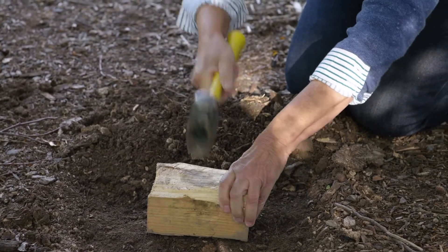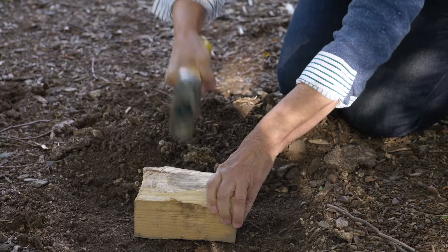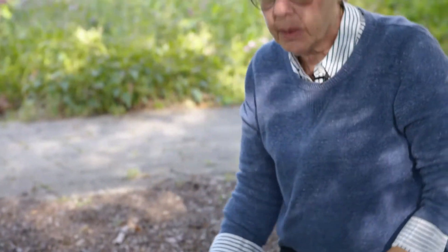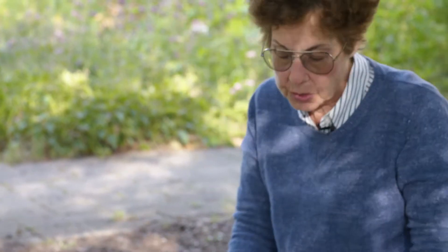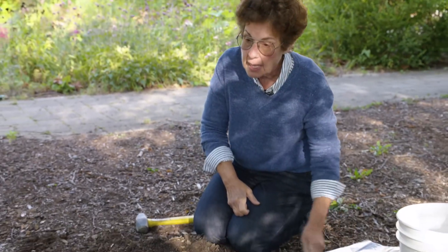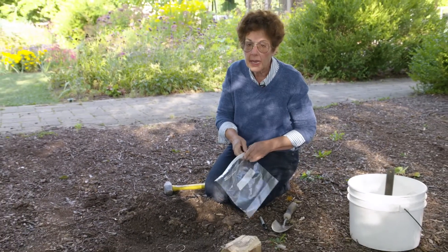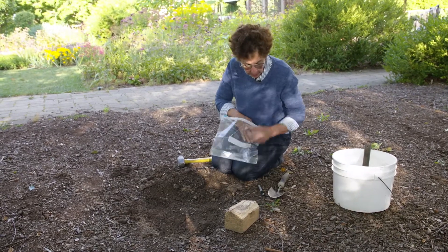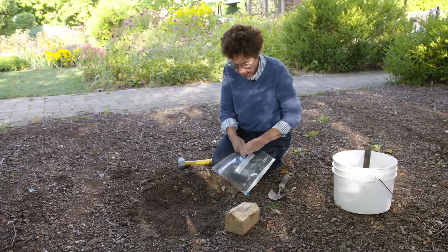We want to pound this in so the cylinder is level with the soil. We've got our cylinder in the soil, and we want to get that known volume of soil out and put it in a bag, which will then dry and weigh. So I have my bag here, which I'll label.